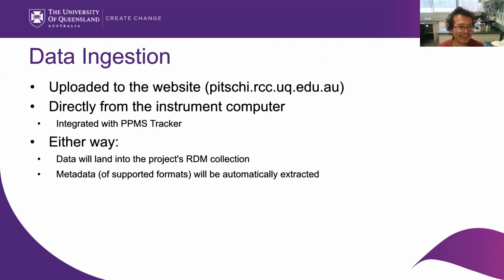Okay, so the next part is how the data is ingested into Clowder, into Pitschi. Sorry, I keep using Clowder and Pitschi interchangeably, but they're the same. Pitschi is just our implementation. Users can ingest data in two ways. They can just upload the data to the website, or Pitschi will capture the data right off the instrument computer. For the second data ingestion method, we integrated the solution with Tracker.